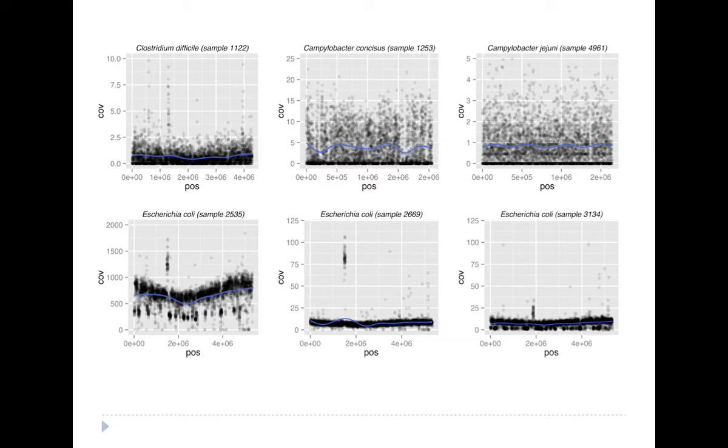So for some plots, we got 1-, 2-fold coverage. Most of these, we're not seeing anything like what we saw with that first STEC sample, but nonetheless, we are getting genome-wide coverage and clearly have been able to identify different pathogens in the samples. The 3 panels at the bottom there are different E. coli positive samples, different depths of coverage, but in each case we see that little upswing where we get the prophage and the phage sequences there.